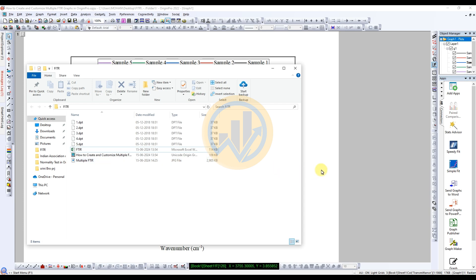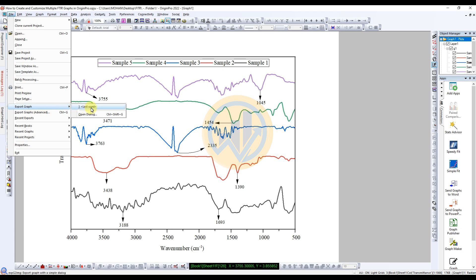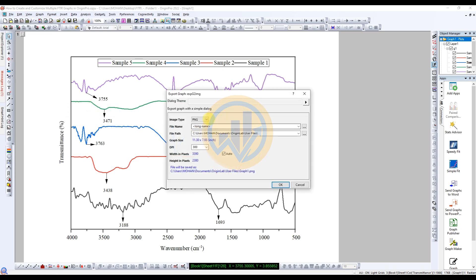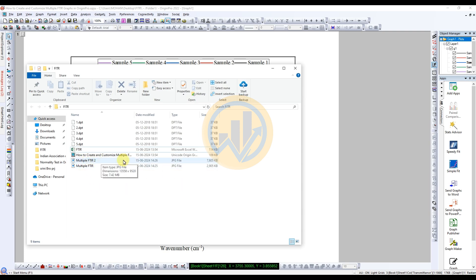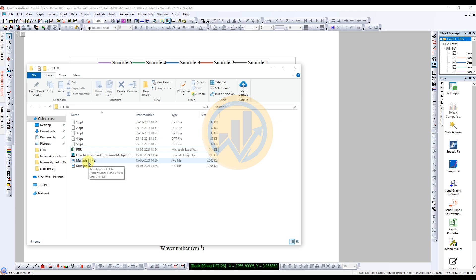At 600 DPI, the file size is 2905 KB. If you want to export at another DPI, open the dialog again with the same JPEG file name and location. Select 900 or 1200 DPI and click OK. At 1200 DPI, the graph size is 7605 KB — this is very high quality. The minimum DPI accepted by most journals is 300 DPI.